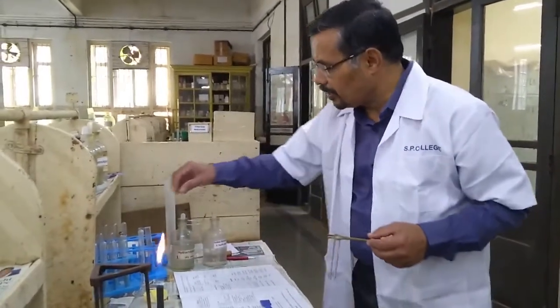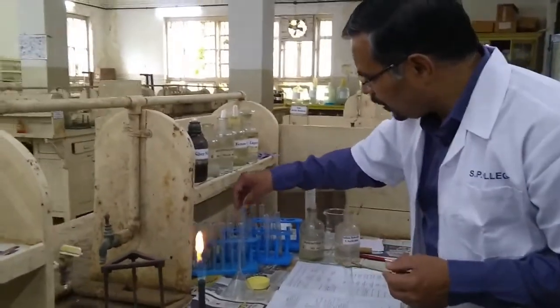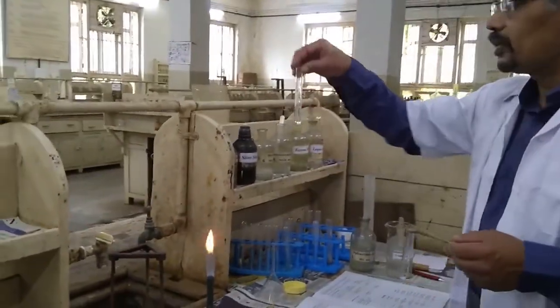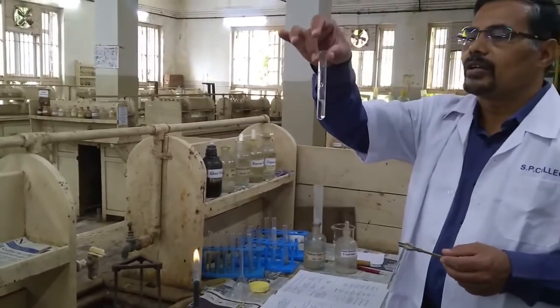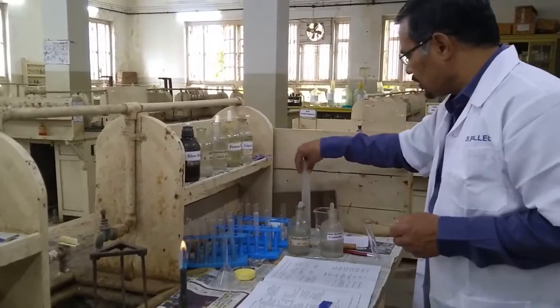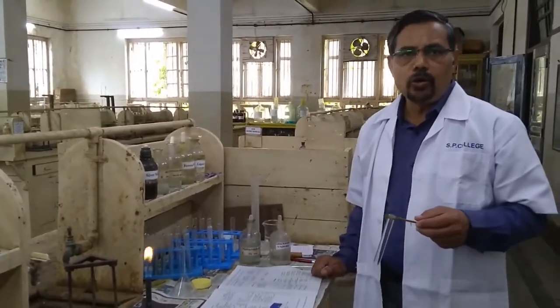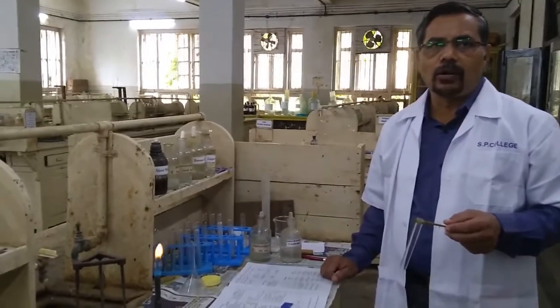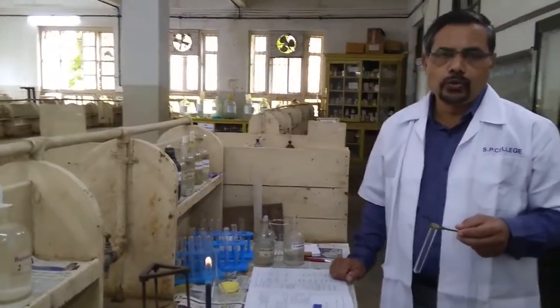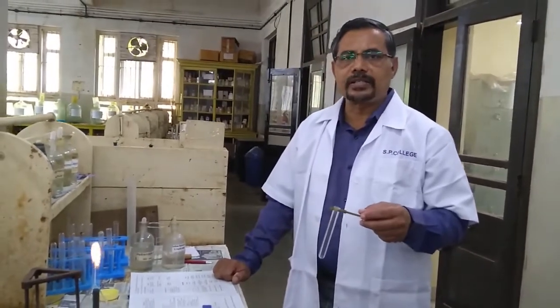We had prepared the original solution of this salt, and we will use this original solution for the further tests. So the first test in the detection of group is, we know basic radical consists of group 1, 2, 3A, 3B, 4th, 5th and 6th group. So first we will test for the presence of 6th group.